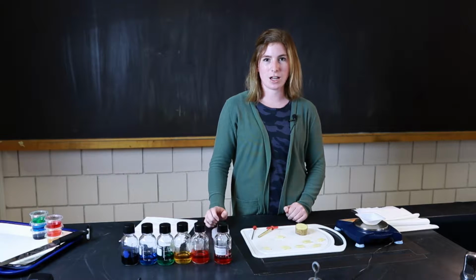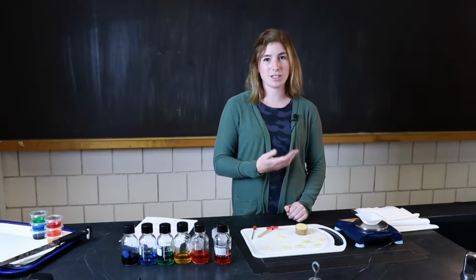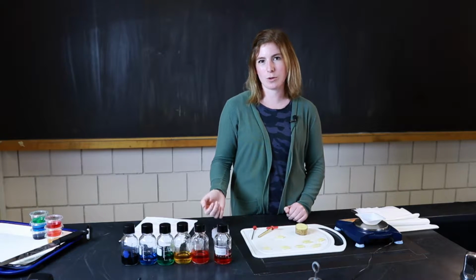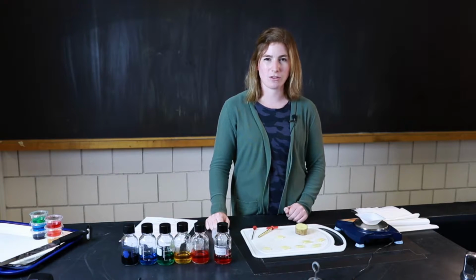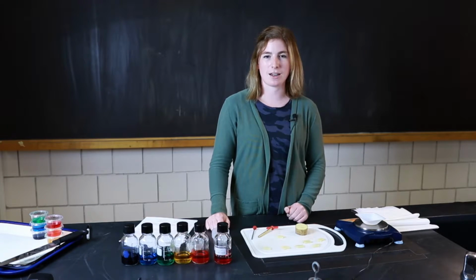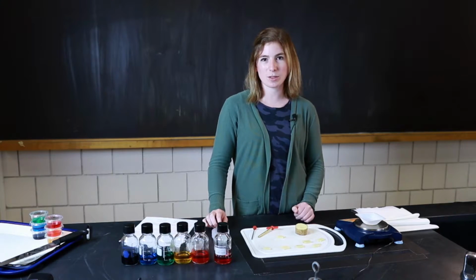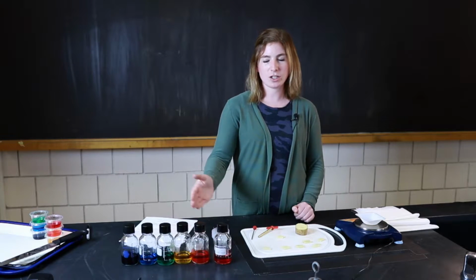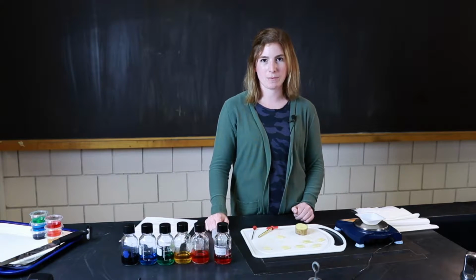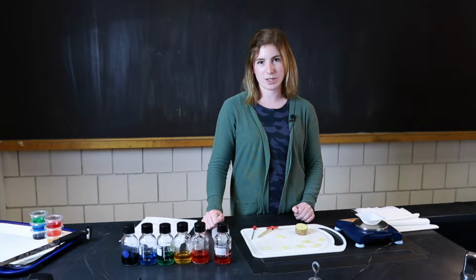We have up to 1 molar sucrose and then going down to 0 molar sucrose, which is just going to be pure water. And then we have different molarities in between. You can find those values in your lab handout. Your job is going to be to use the principles of osmosis and water potential to figure out which solution is which molarity. To do this, you need to make sure that you go back and read some of the introductory information about water potential.